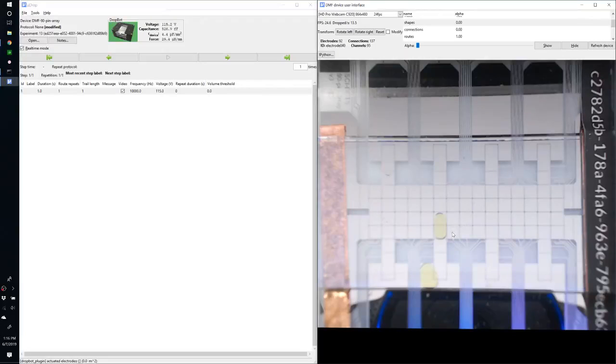In this video, I'm going to demonstrate programming a simple protocol just to perform a mix on this drop. So the first thing that we'll cover here is that we can operate in real-time mode.